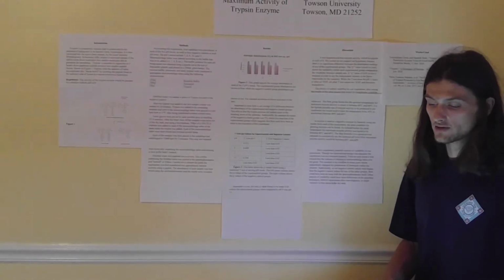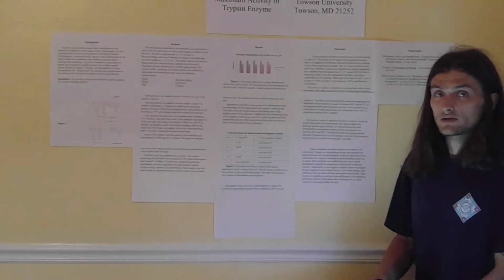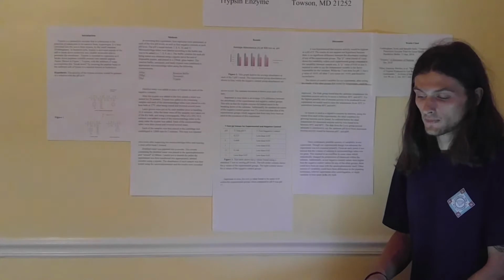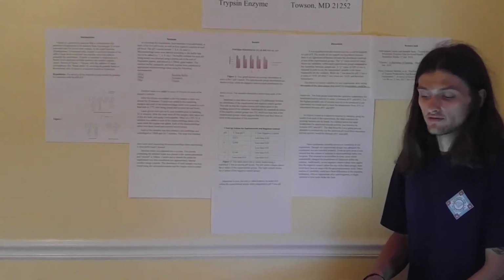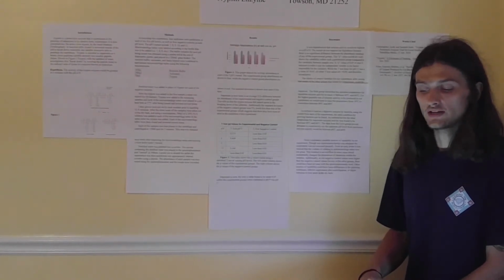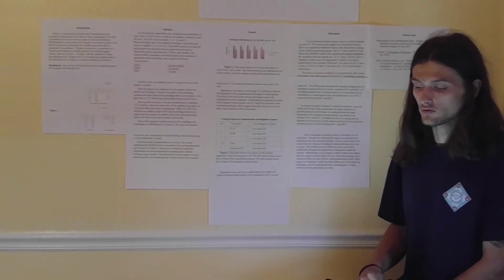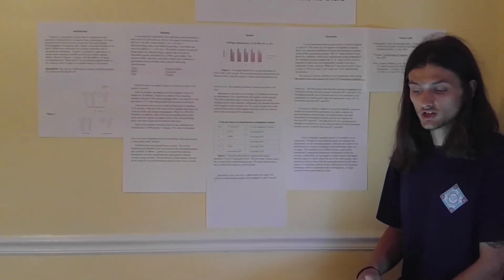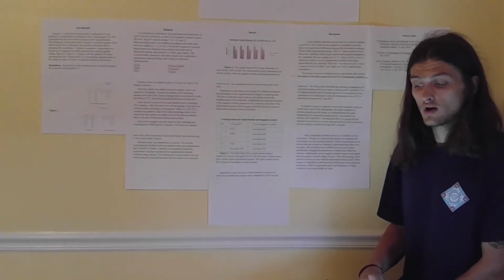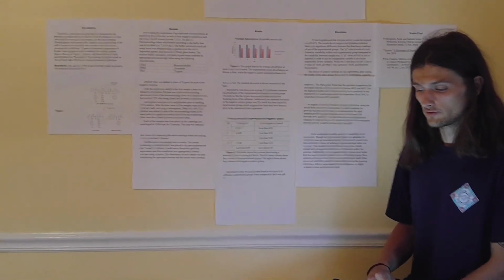There could have been many possible sources of variability in our experiment. Though our experimental design was adequate, the experiment was not executed properly. From an early point, it was noticed that the volume of solution in microcentrifuge tubes was too great. This resulted in an overflow in some cases, which undoubtedly changed the proportions of the chemicals within the solution. Additionally, as our negative control values were higher than the negative control values for any of the other groups, there could have been an issue with the spectrophotometer itself.